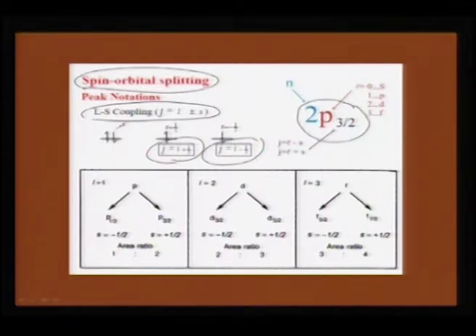The 2 is your principal quantum number that determines which shell the electron is involved in the spectra, and the suffix has to do with the coupling. If you are looking at a 2p 1/2 or 2p 3/2 spectra, there will certainly be a ratio of the area for these peaks. For 2p 3/2, the area under the curve will be approximately 2 times more than the 2p 1/2.